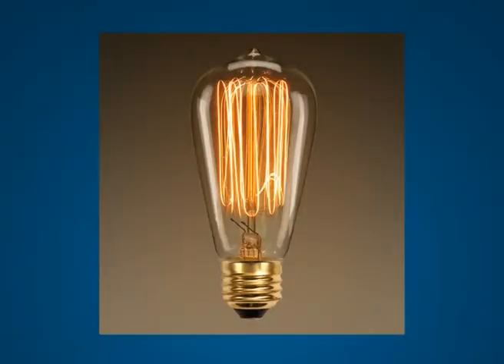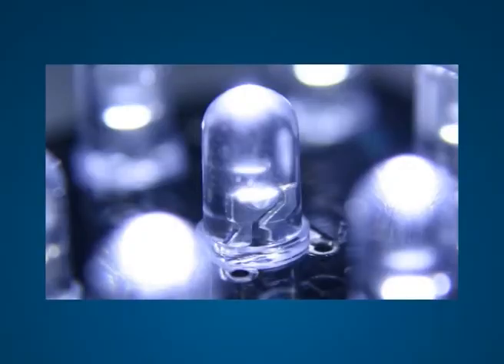Light sources. VSC has different light sources. The incandescent filament lamp ranges from 400 to 1000 nm. The range covers visible to near infrared light. These lights are used when one intends to utilize the function of flood, transmitted, spot and side light. The LED lamps, which have a light range from 400 to 700 nm, are available with coaxial and diffracted light facilities.